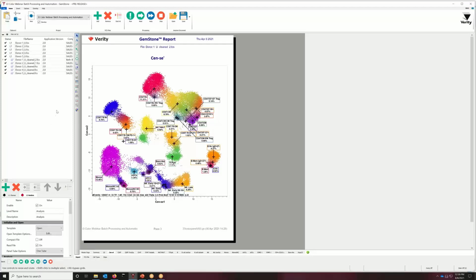Keep in mind that the folders in that project library are already populated with some previous results. You can either change the place where the results go to, or if you want everything to go into those folders, that's fine too. That's user defined.